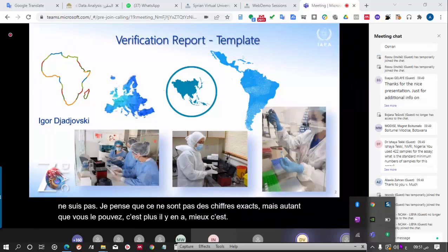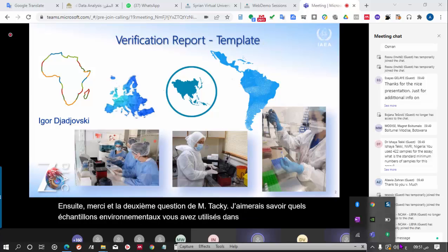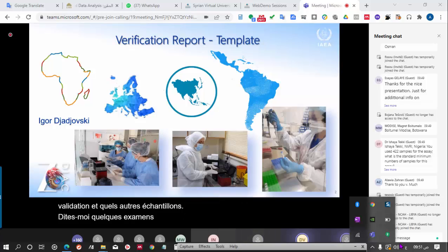Then thank you. And the second question from Mr. Taki is, I would like to know what environmental samples you used in your validation study and what other samples could be used. Well, we were performing some examinations in the facilities where the infected animals were held.